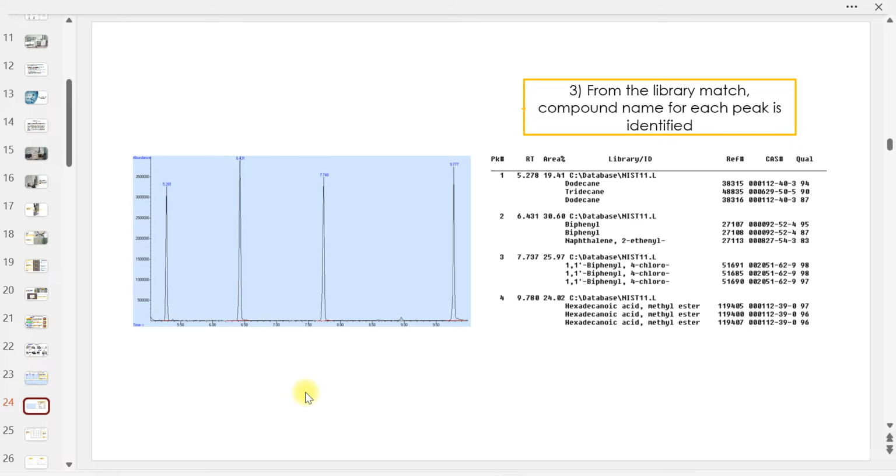Boleh, boleh. But still, if you compare with retention index, the result is not very accurate juga. Sama juga sebenarnya. Boleh lah kalau nak cuba. No problem, nanti saya tunjuk. Saya pun buat retention index tu.